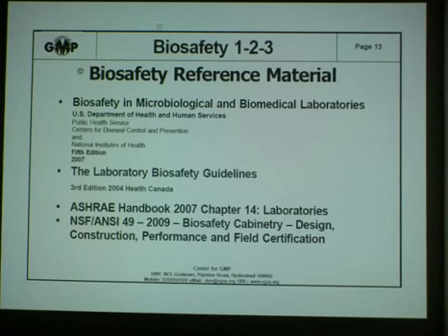Please remember that biosafety cabinets are being used by us predominantly to ensure that the air inside is bio-clean and there is both bio-exclusion as well as bio-containment. Now, how do we test it except microbiologically? This entire procedure, the SOP, step by step, is given in NSF 49, which you could download. I only briefly tell you what the process is about.